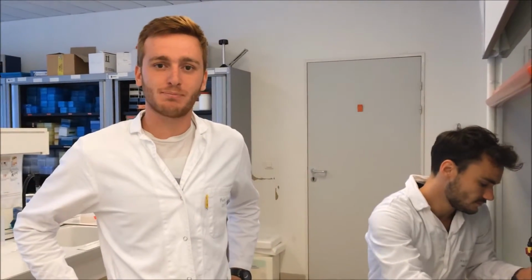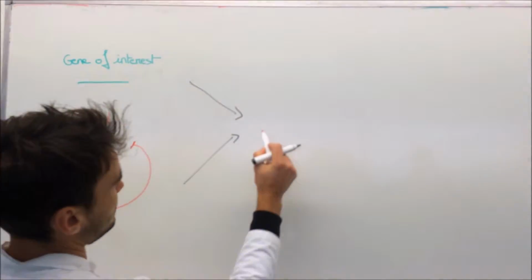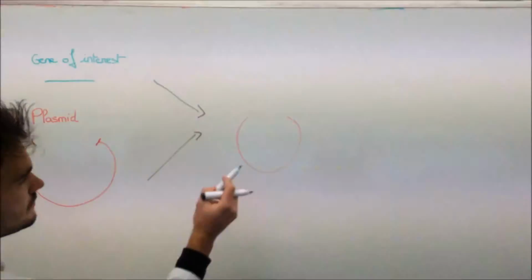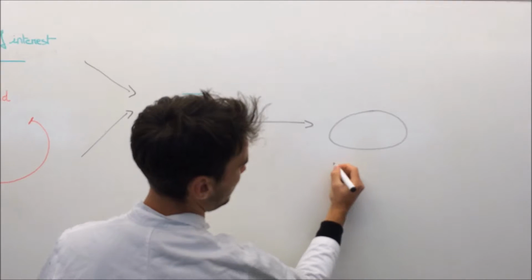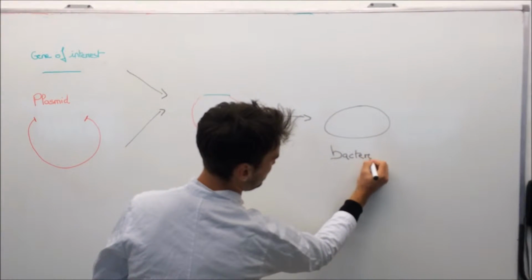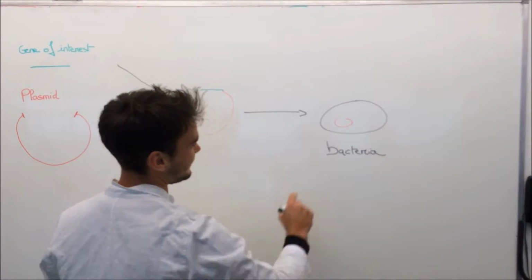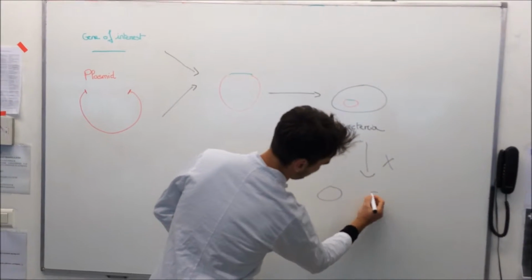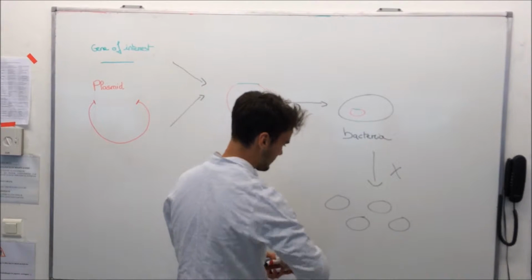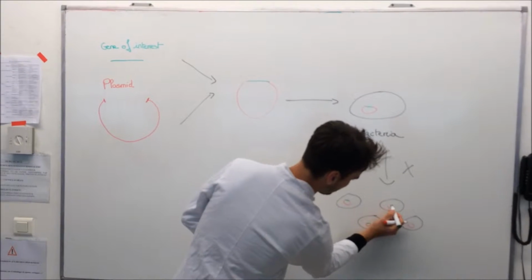Thank you, Nicolas. So today, we will only focus on the upstream part of the process. The first step is the molecular biology part. The goal is to insert the gene encoding for the protein of interest into a circular DNA molecule called the plasmid. This plasmid is then inserted into bacteria, which replicates the plasmids when duplicating. The plasmids also contain a gene encoding a protein, giving the bacteria an antibiotic resistance. This trick allows bacteria to be selected using a medium containing this antibiotic. After having selected only the bacteria carrying the target plasmid, the production process can now begin.